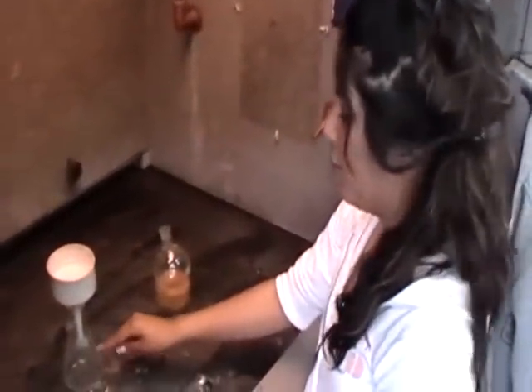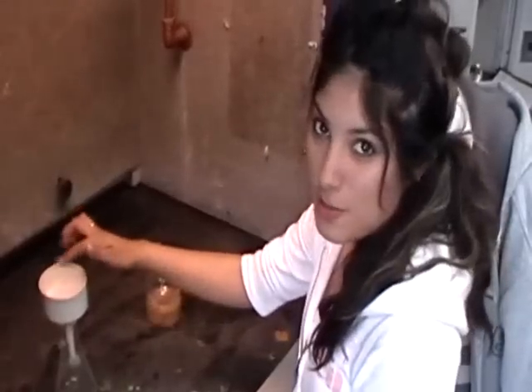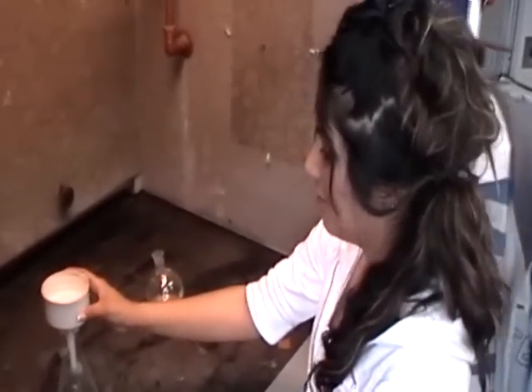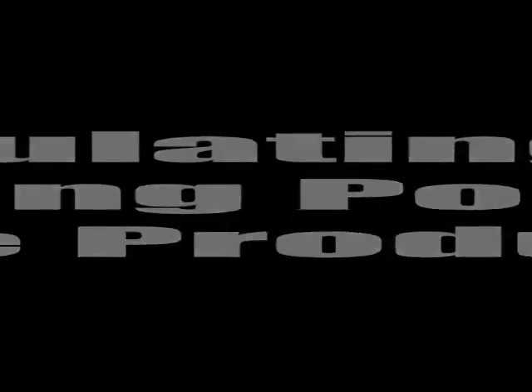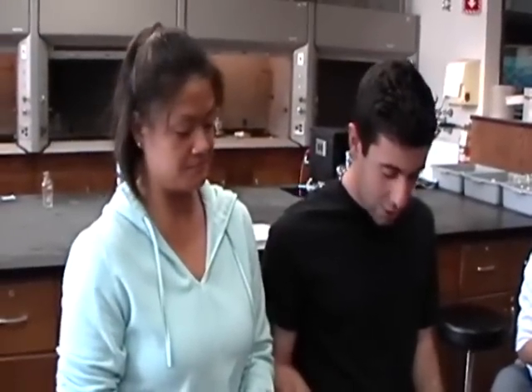As you can see, it's going down and the water is disappearing. Now that we got our product, we have to do the melting point. Let's do it.